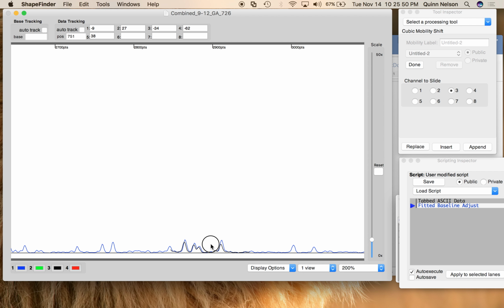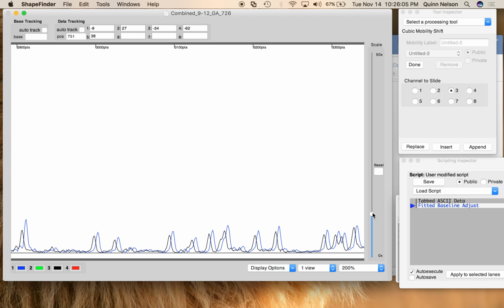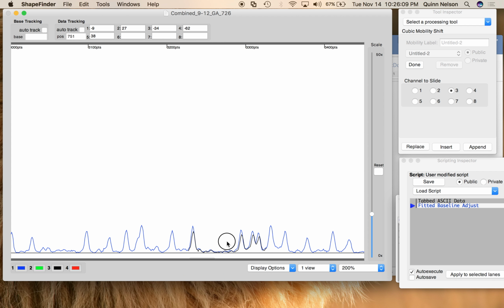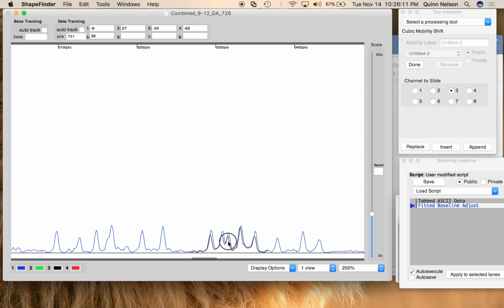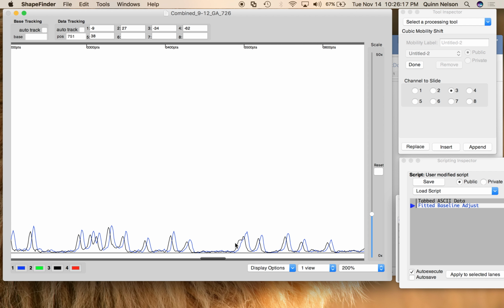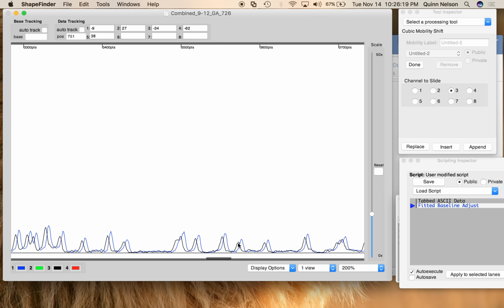Now we're starting to get into the hills, which is normal. Every time I've done this, right around 3,000 data points, it starts to look like this, where it's gone from sharp peaks, and now they're kind of hilly, right? And we can make them sharper if we just crank it up. And that's okay to do for this analysis step, this shifting step, which is fine. So we're going to crank it up. If you haven't cranked up the scale, make it easier on yourself. All of this is still good data.